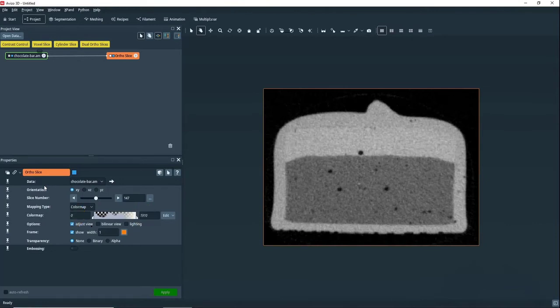So with a grayscale color map, low values are turned to black, high values are turned to white, and the intermediate values are just shades of gray.